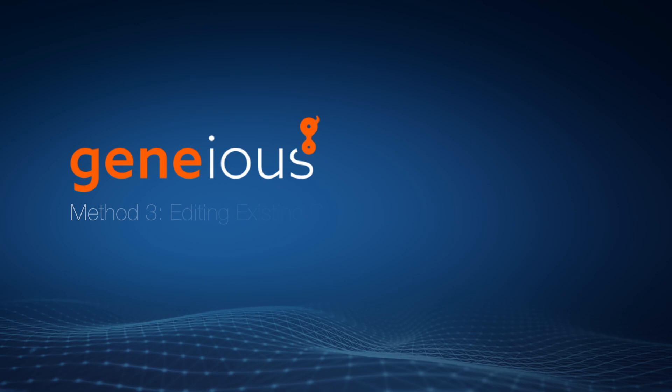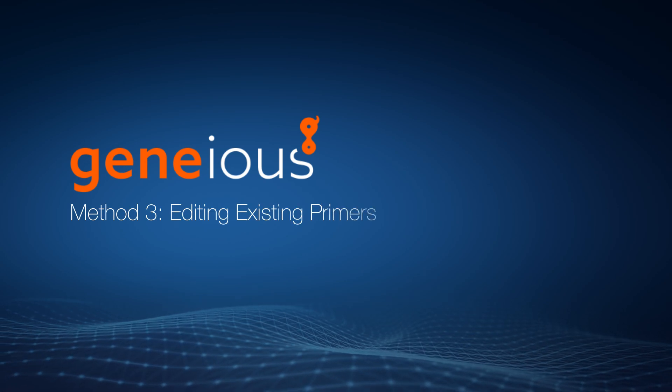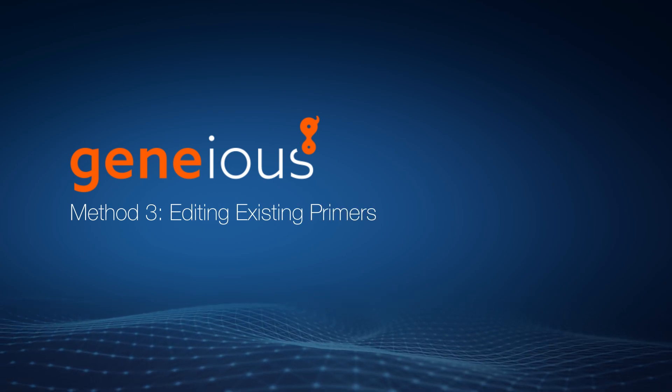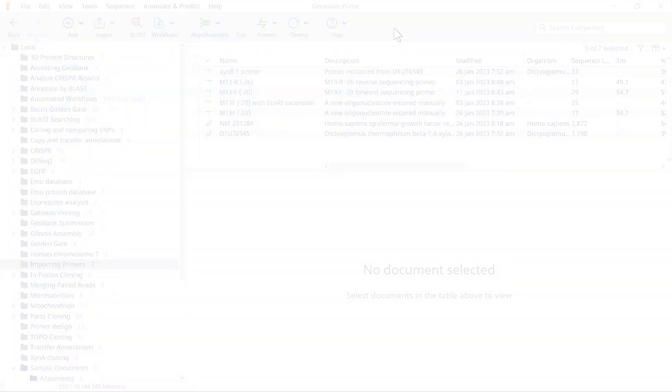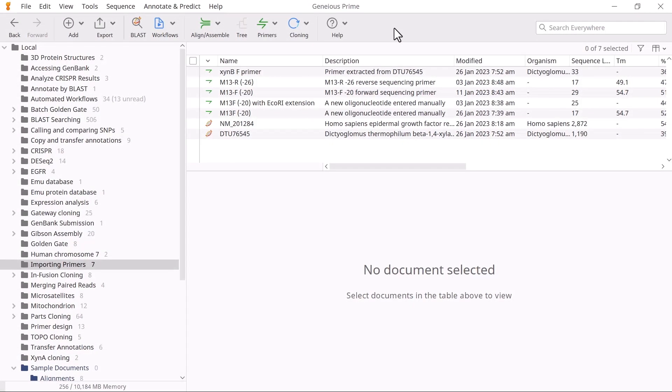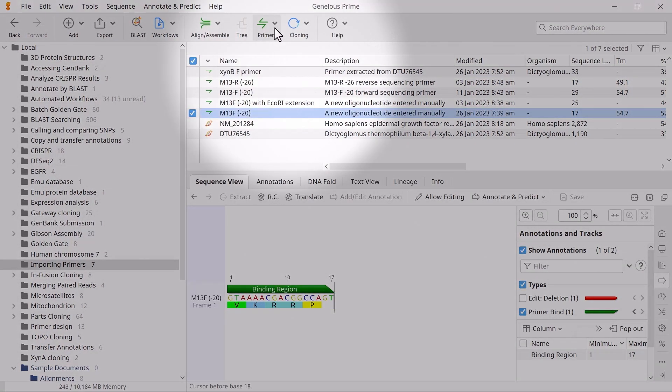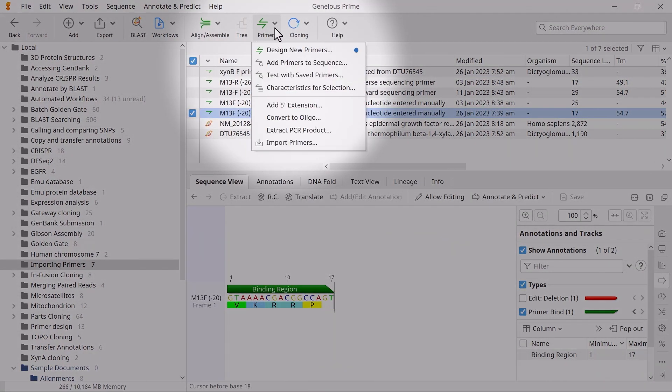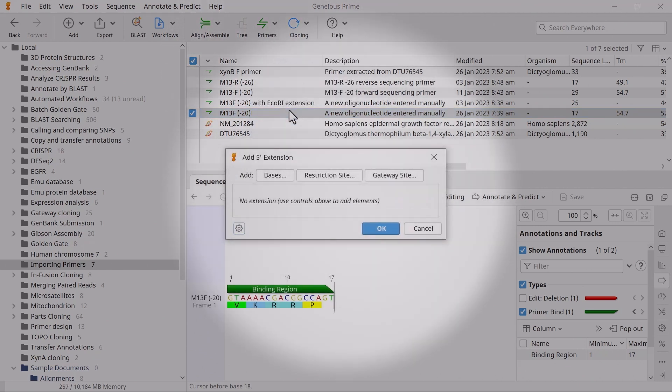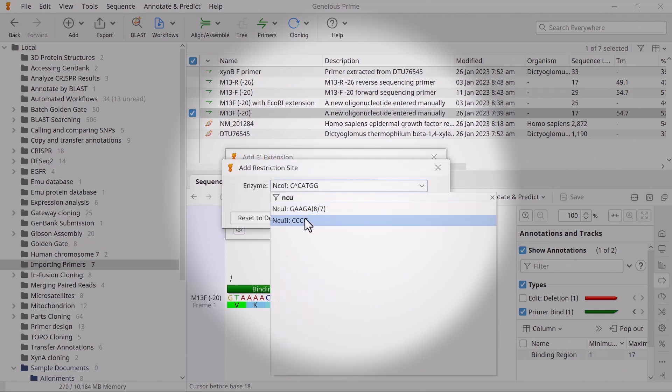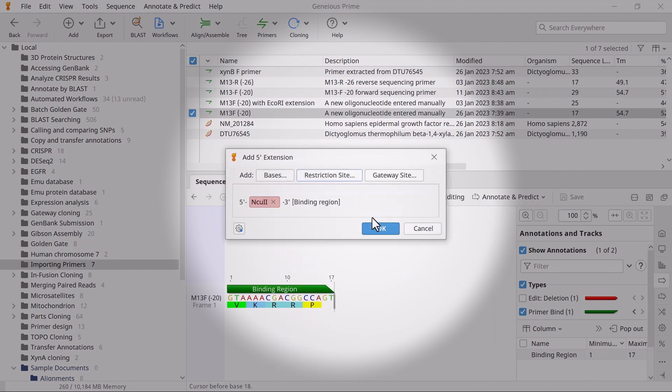Lastly, let's edit existing primer sequences to add five prime extensions. To add a five prime extension to an existing primer file, select it and go to Primers, Add five prime extension. The Add five prime extension options will open, allowing you to specify your extension sequence as before.